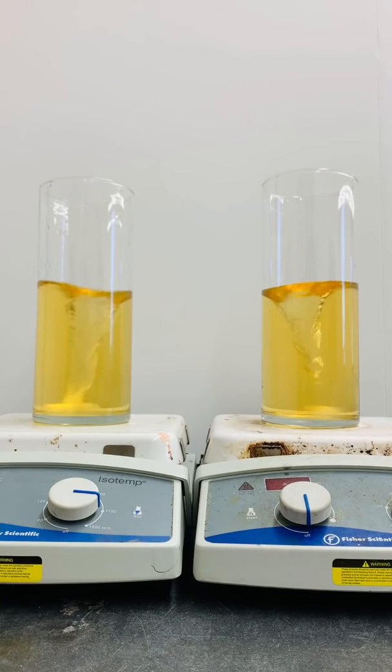You're looking at two solutions with universal indicator added. The yellow color tells me these solutions are at a pH of 6, which is slightly acidic.